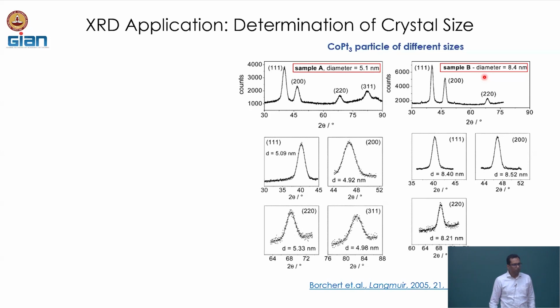In one case we are at about 4000 counts, in the other case it is close to 6000 for the bigger particles. So, there is an answer from the online: particle diameter and intensity. Particle diameter, we have not gone into yet, but we will look at that next. Yes, intensity is something that we are seeing. And one more answer from Suraj, FWHM had some difference. Full width at half maximum, okay, that is also correct, but I will just elaborate that a little bit.